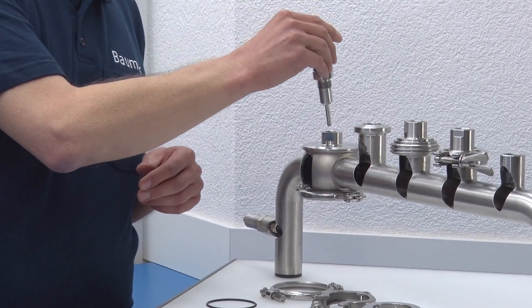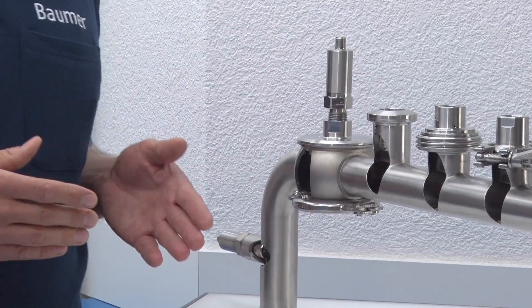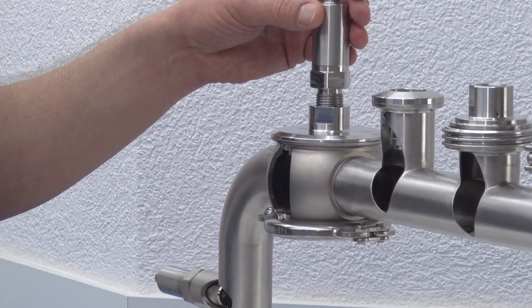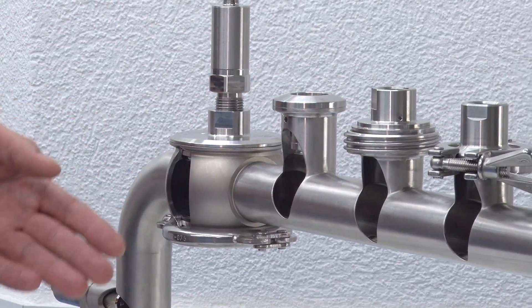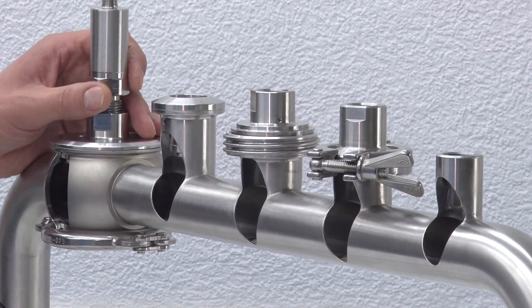As you can see, thanks to matching adapters, the same sensor can be used in any of these process connections. This provides you with maximum flexibility.